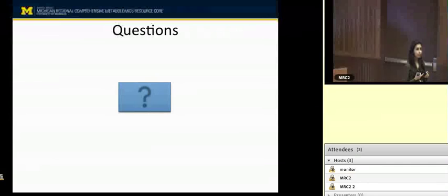Like, if you do one analysis, something is coming out significant on the positive mode data versus the negative mode data. So yeah, if you want to look at it yourself more, you're free to do that. But I think for the combined report, mostly we've taken care of all those issues, and you can just trust that data.